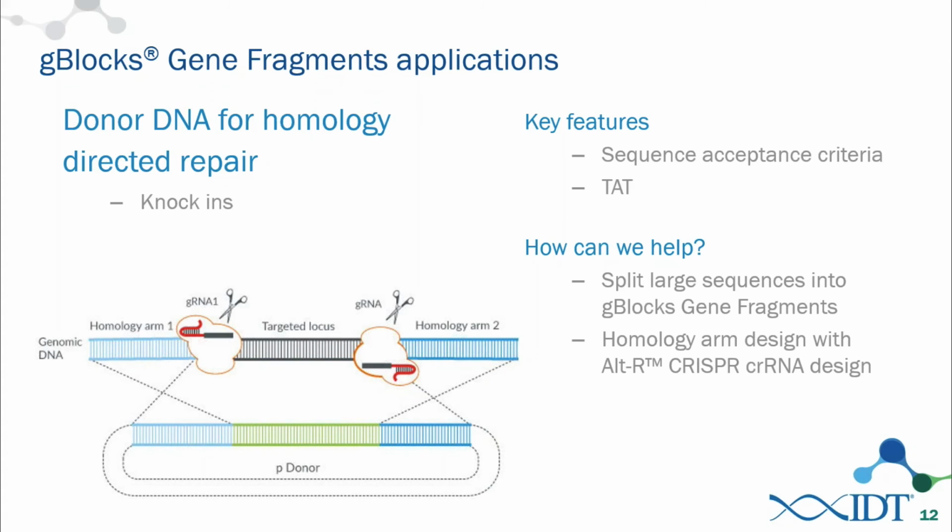As far as the actual stability of gBlocks goes, we have not done a long-term stability study with gBlocks, but we have used and routinely use gBlocks that have been stored for a long period of time, and we reconstitute things within the lab with good success. We've used them well over a year old, and we have customers that routinely use them for that length of time with no problem.